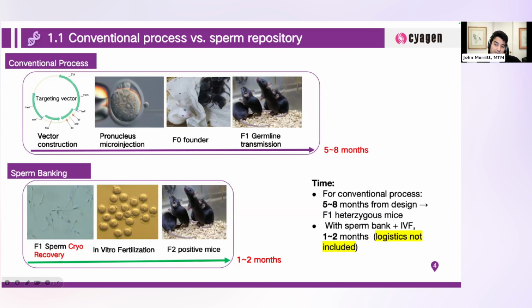So in essence, we maintain a sperm bank because it's more economical than a live colony, and it also allows researchers to reproduce your work on a faster timeline than having to do a pronuclear injection. And also, from a quality control and reproducibility standpoint, starting from a sperm bank is better than having to redo the work from single guide RNA. So there's actually even better reproducibility and quality control in that.